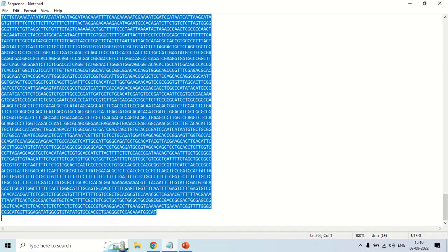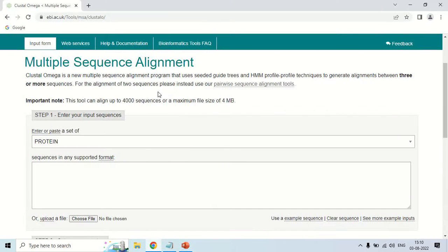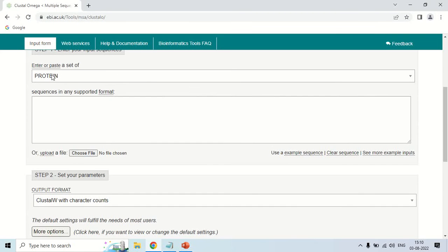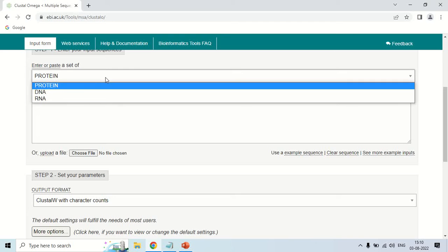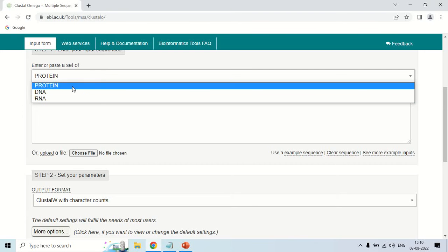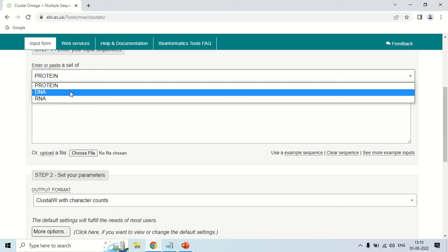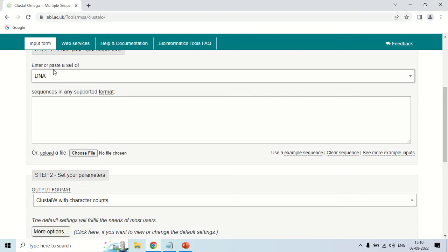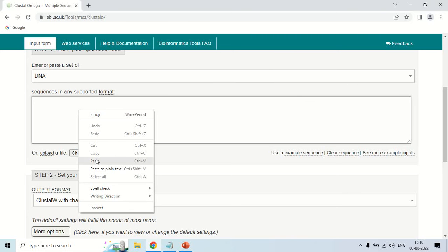Just copy these sequences and move back to Clustal Omega. The first option asks you to enter or paste a set of either protein, DNA, or RNA sequences — it is asking what type of sequences you are going to use. Since I chose DNA sequences, I am just clicking on DNA and now pasting the sequences here.